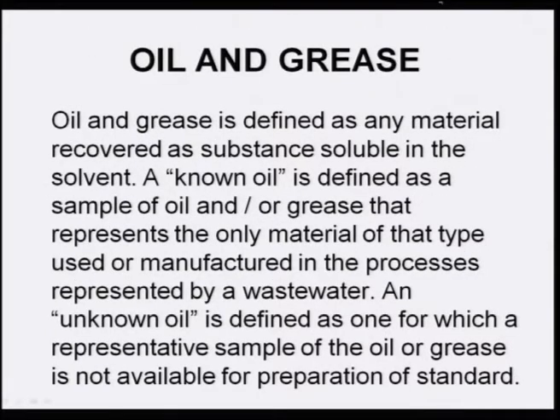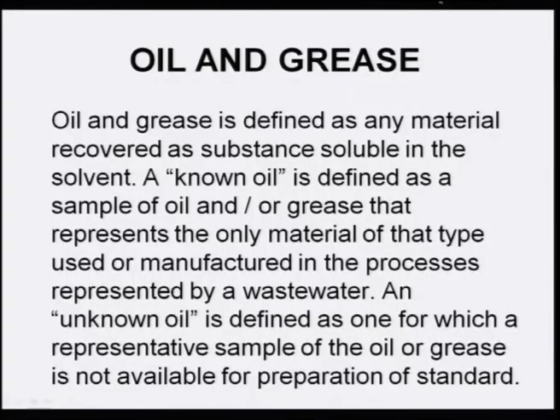Oil and grease, how they are determined in a water sample, because sometimes water does have some oil particles floating on the top. Oil and grease is defined as any material recovered as soluble substances in the solvent. A known oil is defined as a sample of oil or grease that represents the only material of that type used or manufactured in the processes represented by the wastewater.